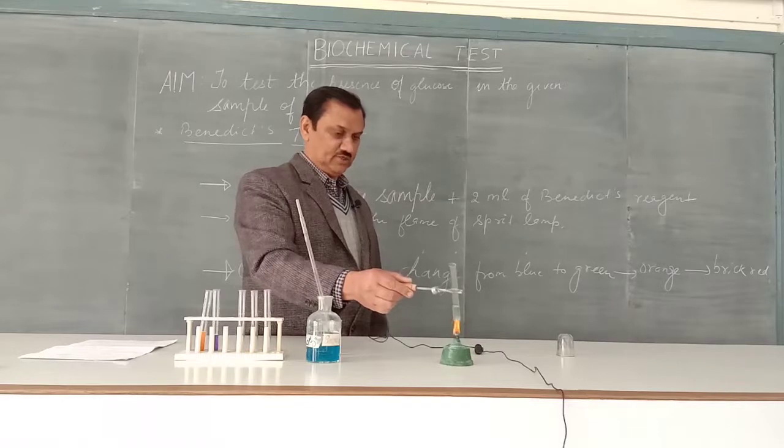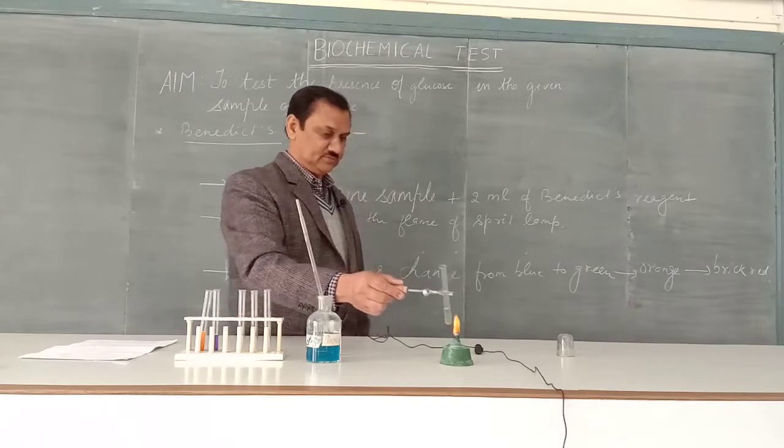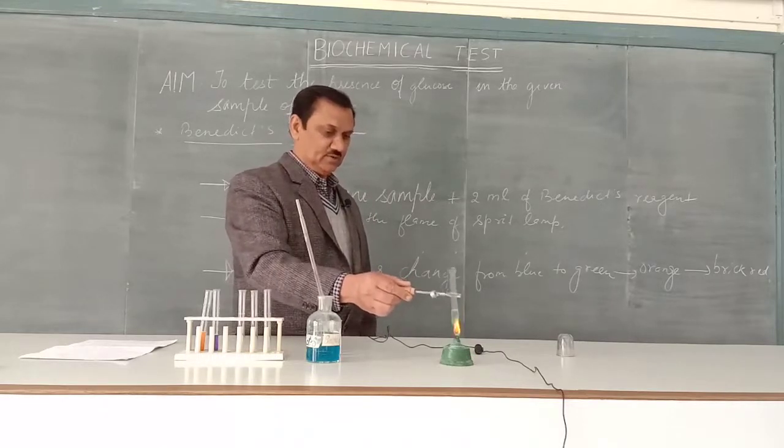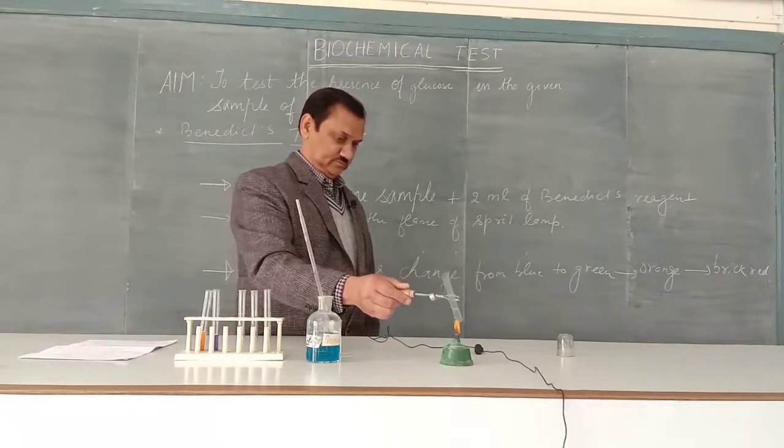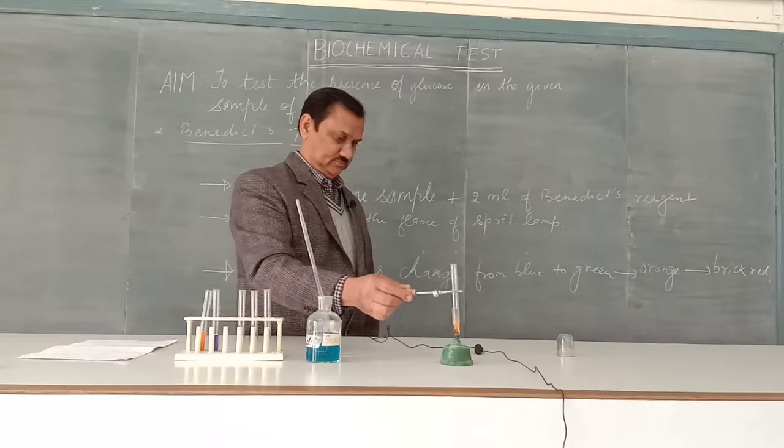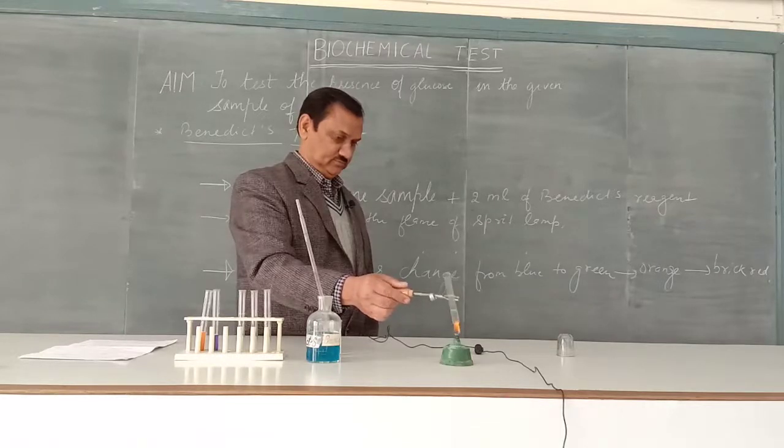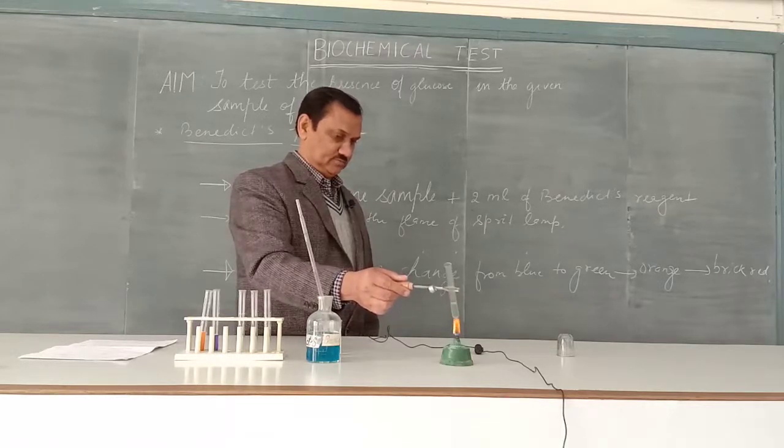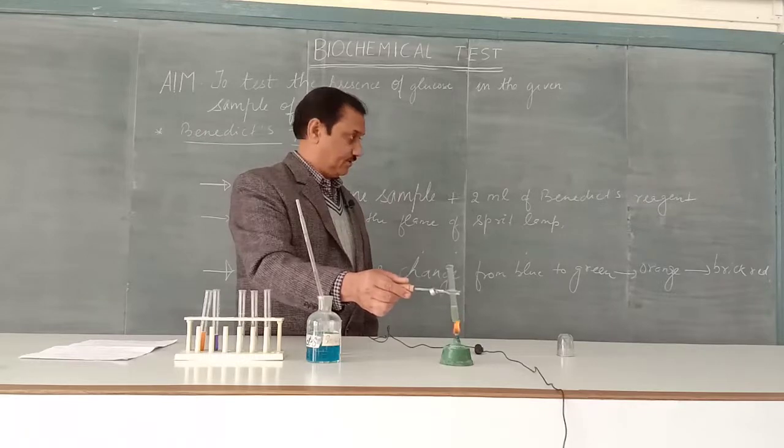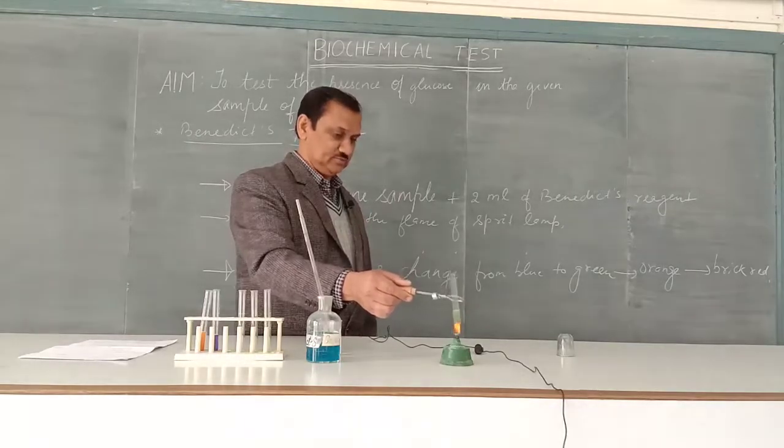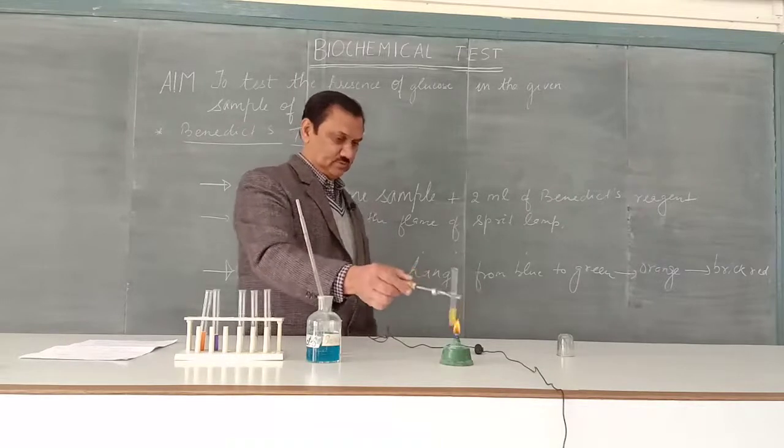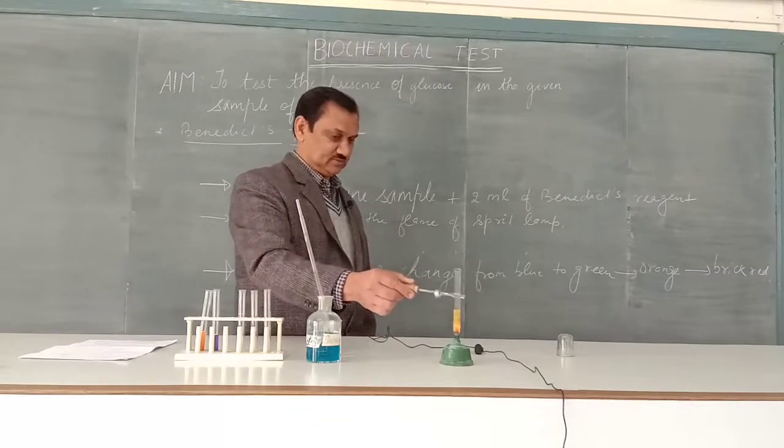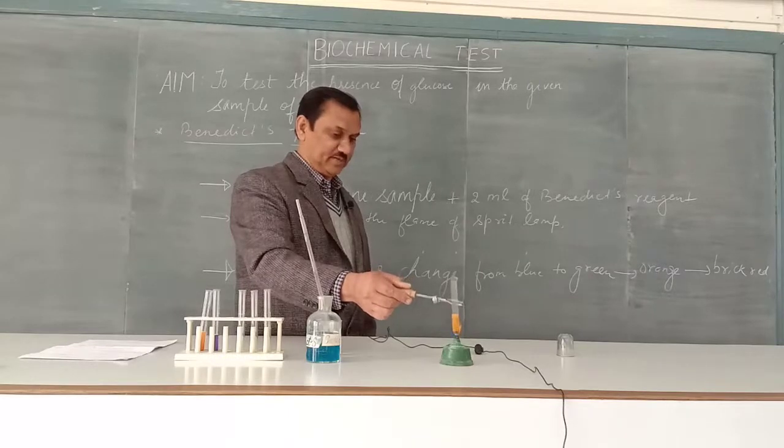The original bluish color of the solution turns into greenish color, which finally changes into orange and then to a brick red precipitate.